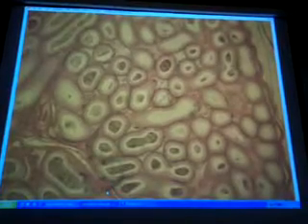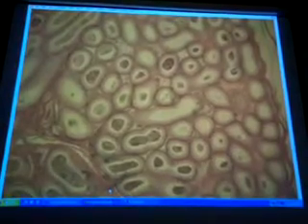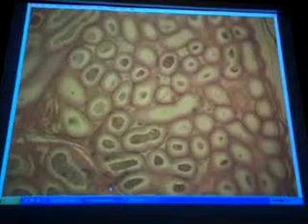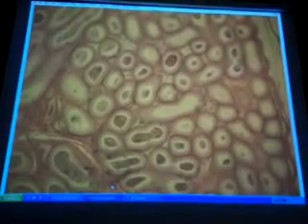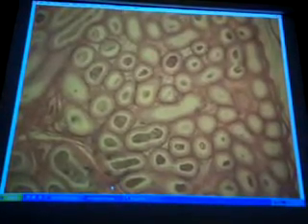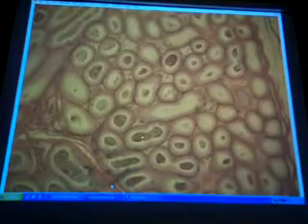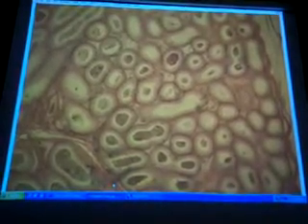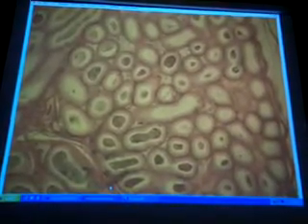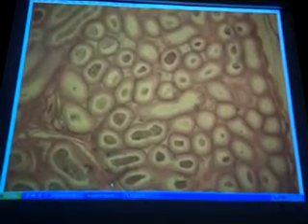Okay, well, anyways, I see a bunch of cut tubes. Remember, the epididymis is supercoiled. When you stretch it out, I mentioned how long it was in lecture. I can't remember off the top of my head. The vas deferens was how many tubes? One cut tube. But this is like supercoiled. So when you cut through the supercoiled, you see a bunch of cut tubes. This is the epididymis. So what's that? Sperm. Remember, this is kind of a storage site for sperm. For males who get a vasectomy, I guess they just kind of die here. They never get out of the epididymis.